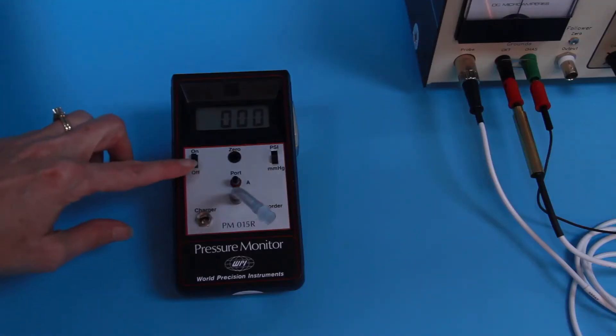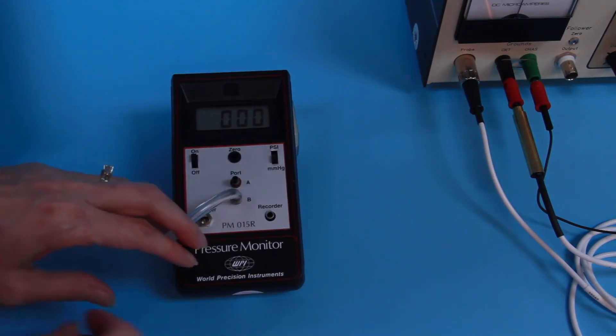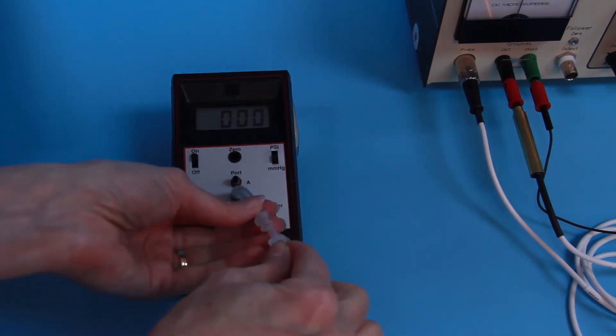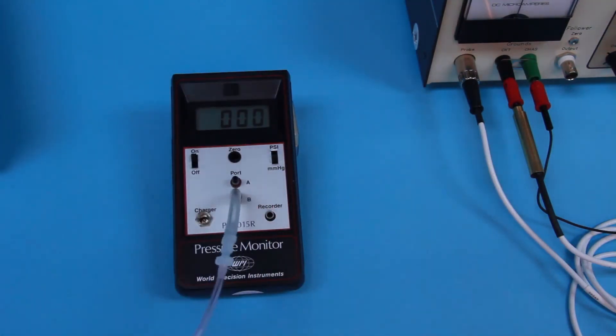Turn on the manometer and set the units switch to millimeters of mercury. Connect the output of the pressure source to port B on the meter to monitor the pressure. Regulate the pressure up or down until the manometer reads approximately 350.